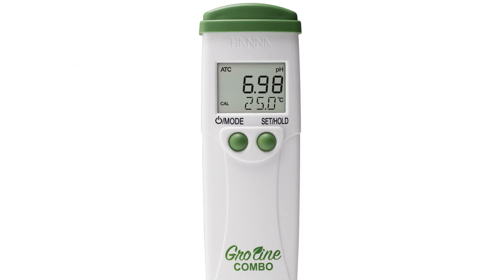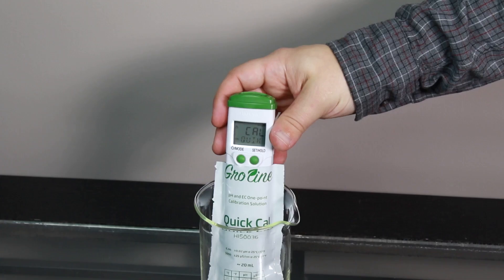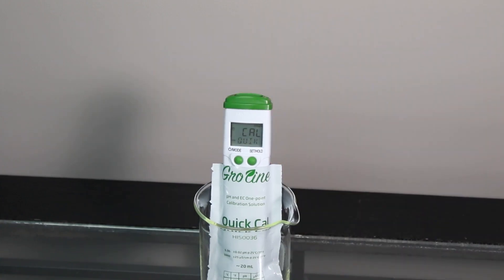To calibrate your meter, press the mode button for 3 seconds until CAL is displayed. If your tester is in the CAL QUIC setting, first rinse the probe in distilled or deionized water. Place the electrode in your GroLine quick calibration solution and wait for a stable reading. Once stable, the tester automatically goes back to measurement mode.